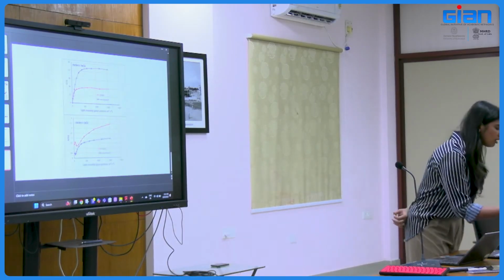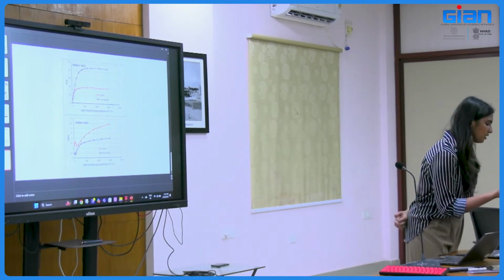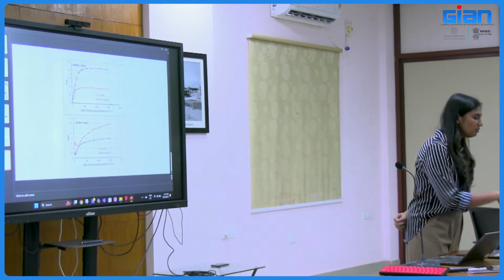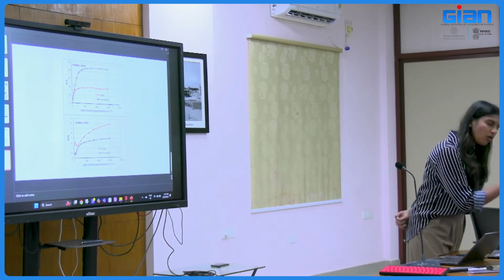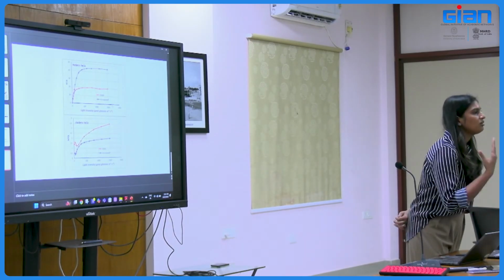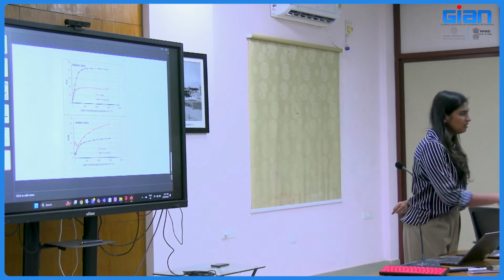You need this PPT, or you can just search for Dual-PAM, or else I will share it. If you need this, I can share, or else there is a handbook, all the details will be there, what the measuring lights are, what the components are, everything. We can share that, which is better than this.